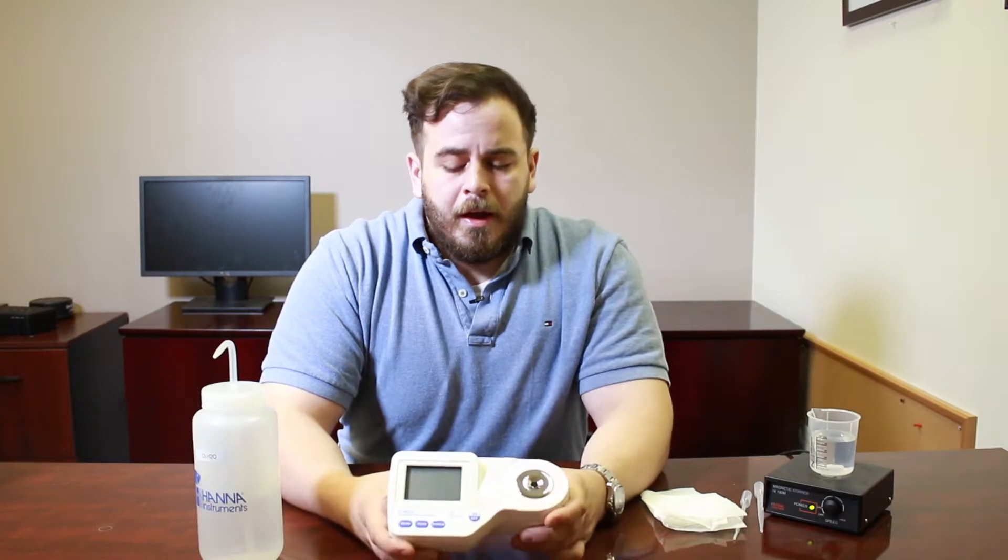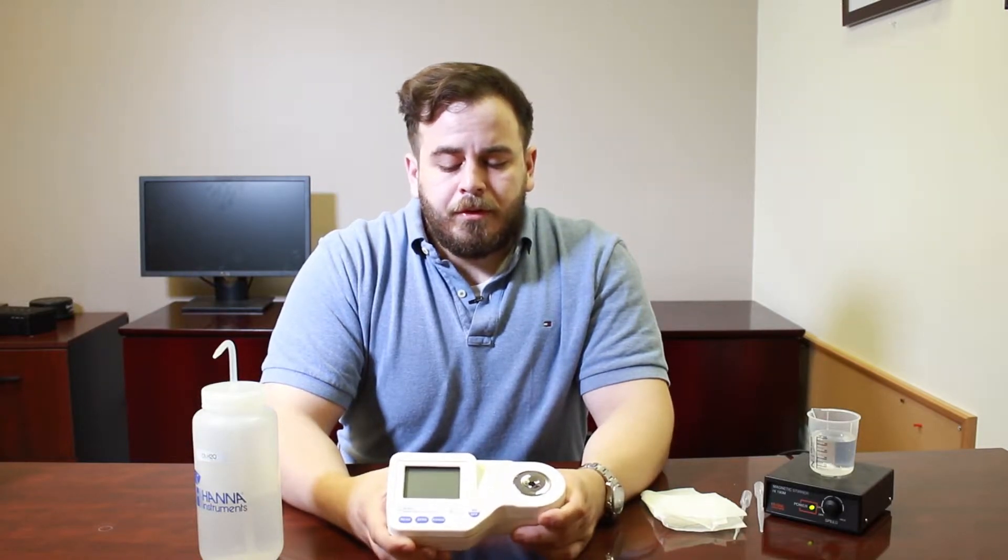There are a lot of different ways to measure salinity. You could use hydrometers, swing-arm hydrometers, optical refractometers, or we like to use our digital seawater refractometer — the HI-96822.